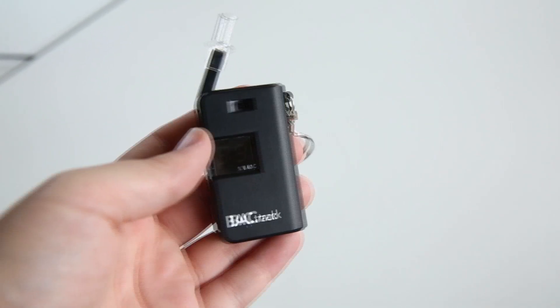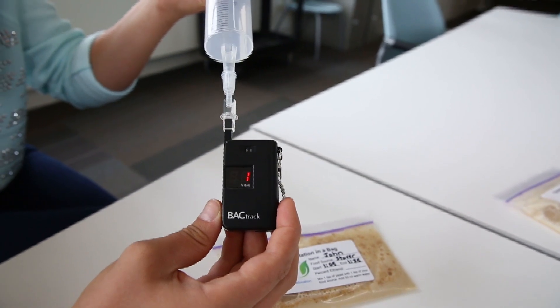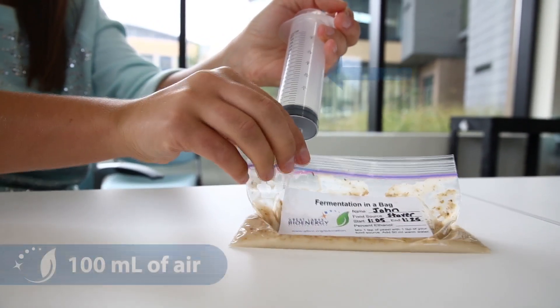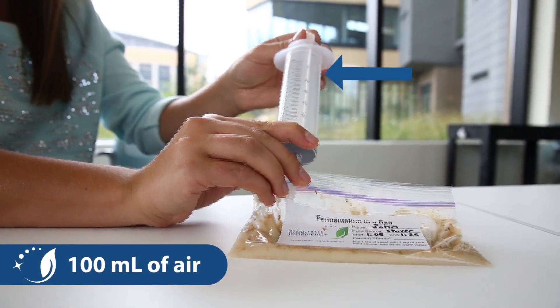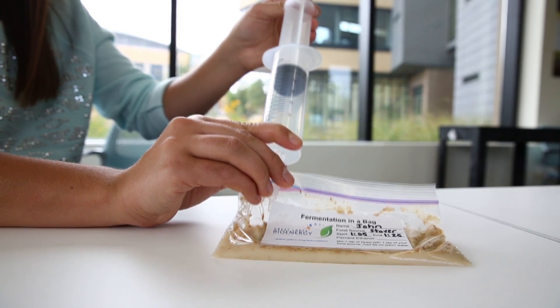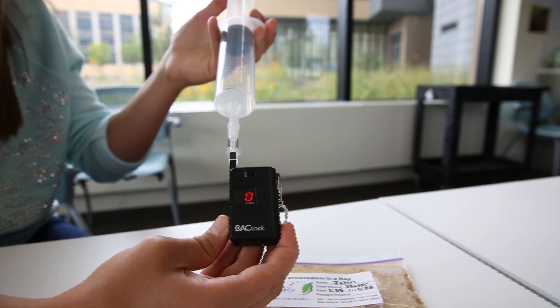You can also use inexpensive breathalyzers to make relative comparisons of the ethanol produced in the fermentation reaction. For this method, use a syringe to collect 100ml of air from the sealed baggie. Be sure to open only a small section so the excess air from the bag does not escape. Then use a syringe to slowly blow the air into the breathalyzer over the course of 10 seconds.